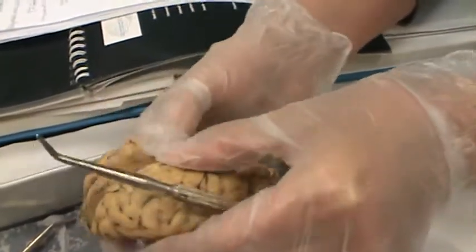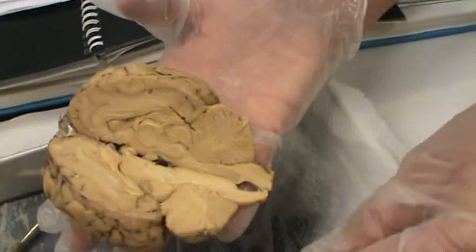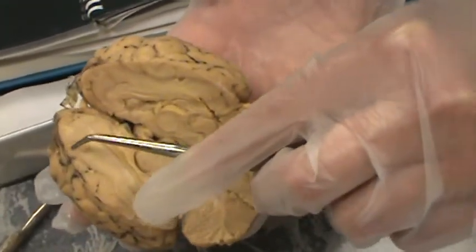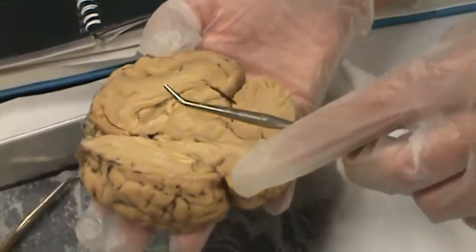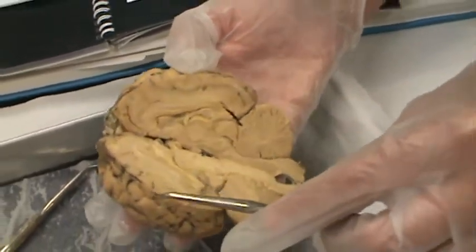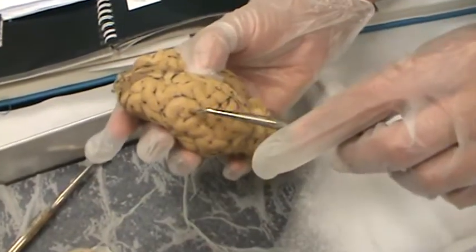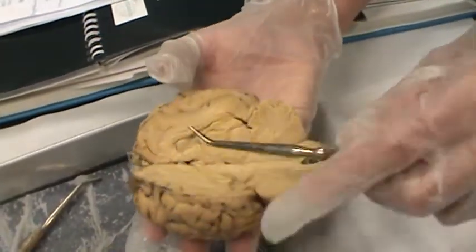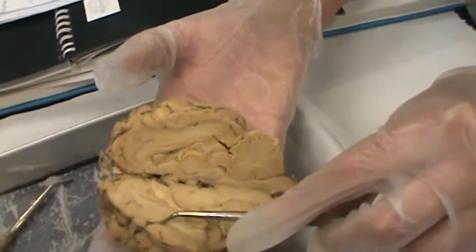The cerebral cortex is the gray matter, which is the outermost layer of the brain. Gray matter. And the gyrus is the bumps on the exterior of the brain, so it would be the bumps here. And the sulci, is that the sulcus? Are the valleys of the brain. So these are the valleys.